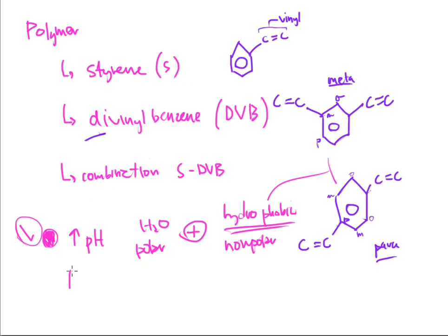And they can also withstand pretty high pressures. They are polymers. They are strength in numbers. These groups are holding hands with each other and they're clustering together. And you can do a lot with them. And it can withstand some pressure. So I can increase my flow rates. And my flow rate is not going to destroy that particle or break it apart. That polymer is going to hold its shape. It's going to hold its structure. It's not going to change over time.